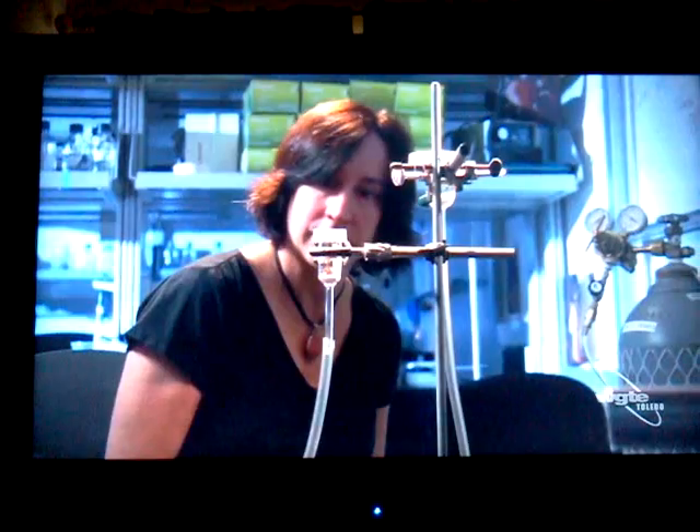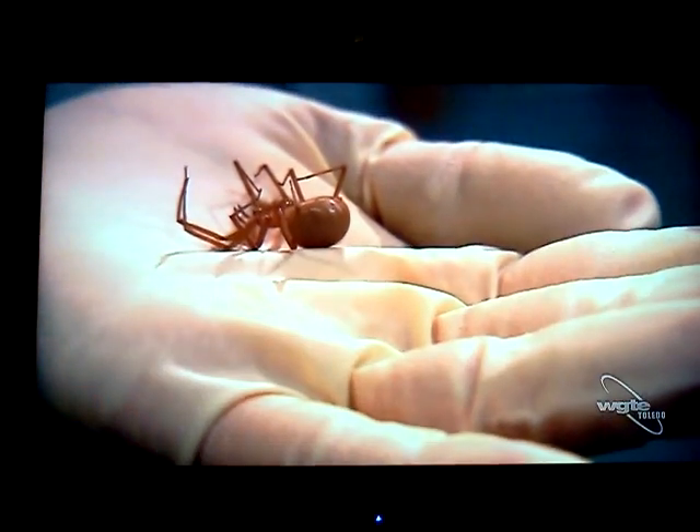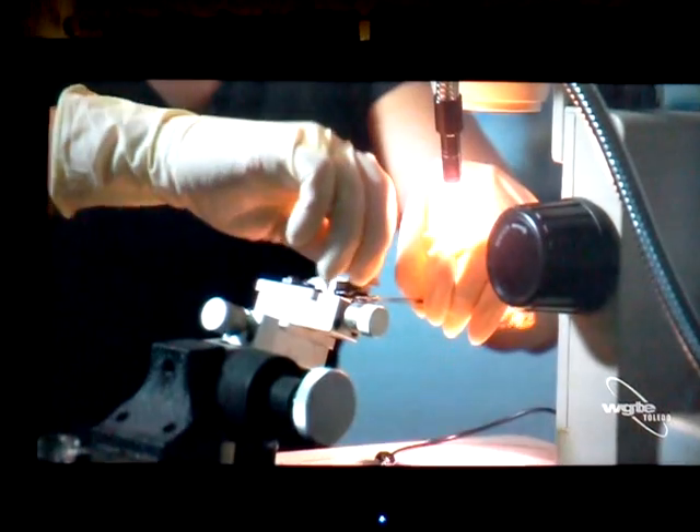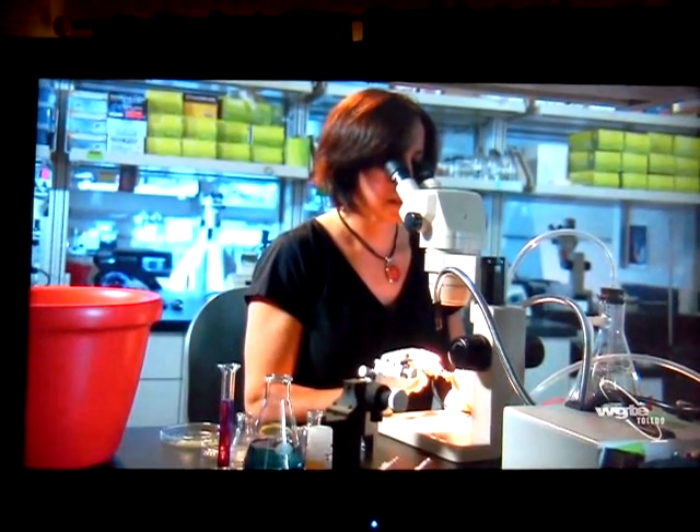Greta will stimulate the sleeping spider with electricity in order to coax venom from its glands. We clamp it with a little bit of salt water on a sponge to improve conductance of the electricity.